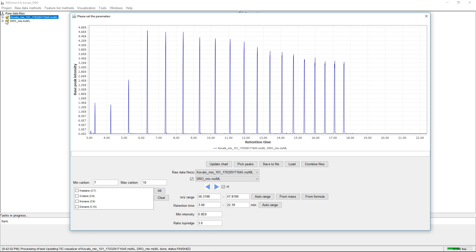Here we have two mixes: the Kovacs mix, which is C6 to C9, and the DRO mix, which is the alkane from C10 to C25.